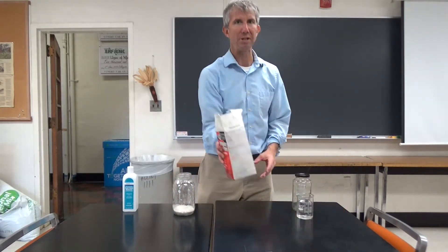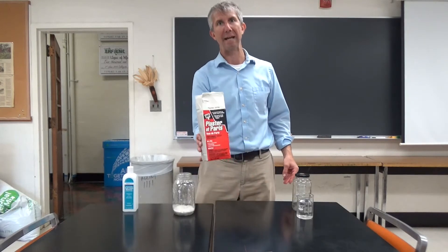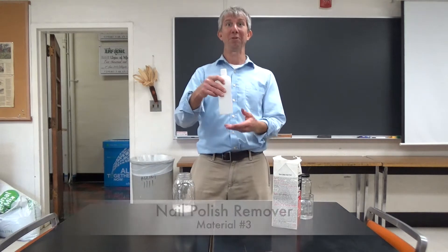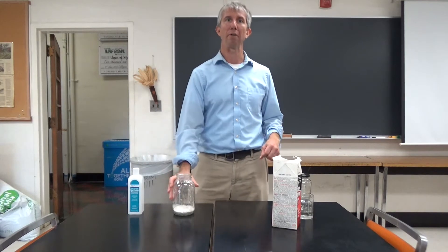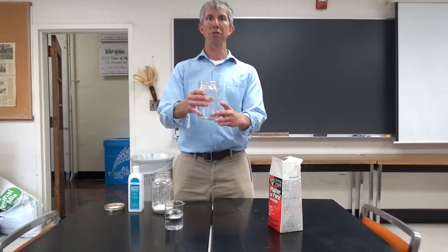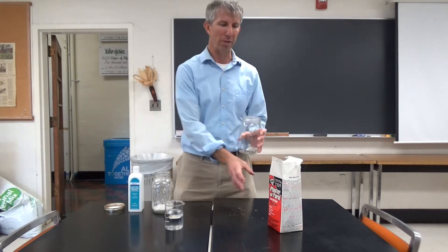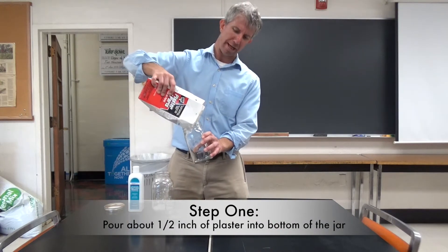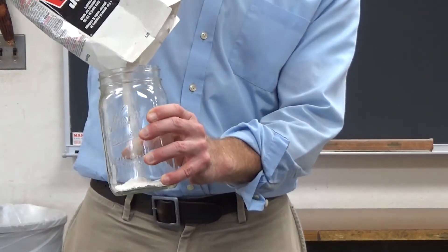We have some plaster of Paris here, and we'll be pouring plaster of Paris at the bottom of the jar, using that as an absorbent for our nail polish remover product, which will provide a poison for the insects to die within the jar. We've got our mason jar here, and the first step is to pour our plaster in the bottom. We'll want it to be about a half inch thick when we add water and have it set up.